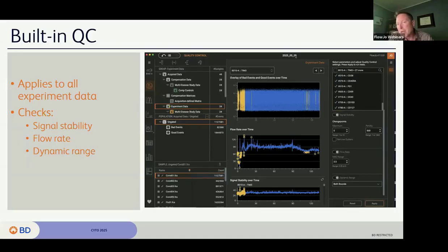And so that was a real-time run that I just did on 48 files, sorry, all 20 in experiment data that had about 30 parameters. And that was the time it took to QC all of them. So I think we've really expedited the QC process, that it takes about as much time to run QC on an entire experiment as it did in one file because we don't have to deal with plugins, and we've made this faster. So boom, I think that's a giant time saver.